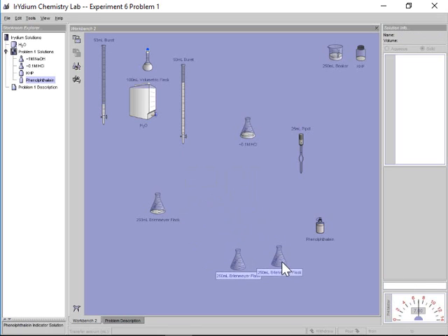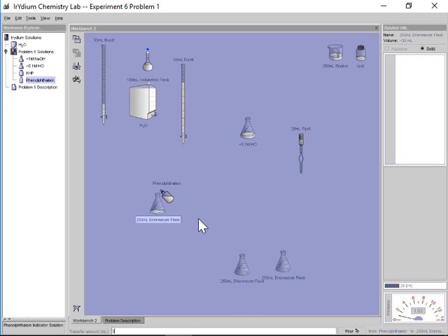We still need to do our phenolphthalein. I still have to use my indicator. That's going to show me when the pink color changes here. So let's pour in maybe 3 ml of that. It's going to tell me when the color change happens.